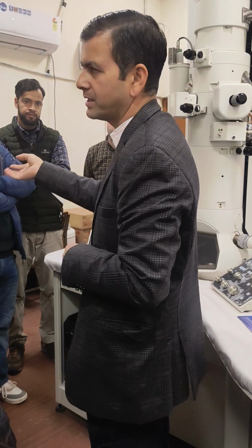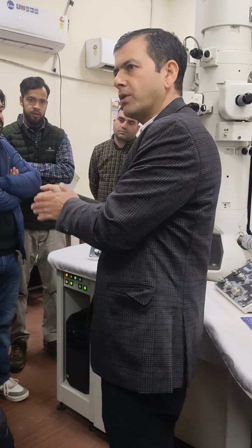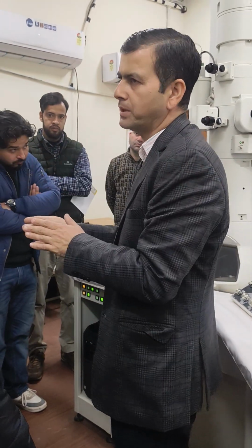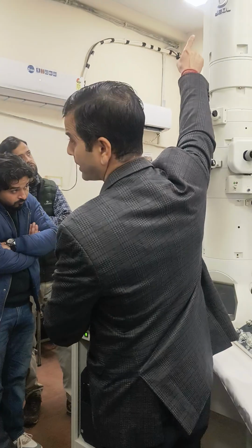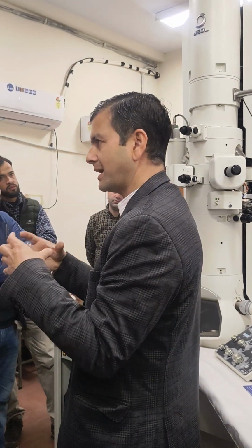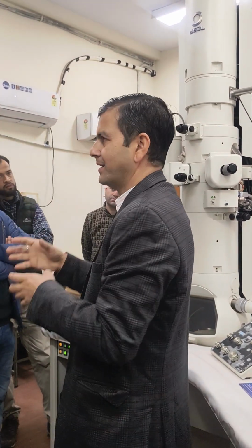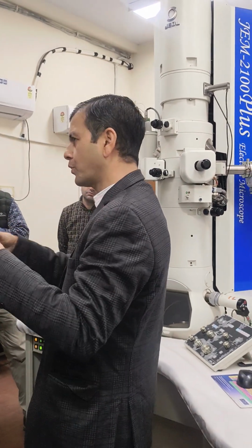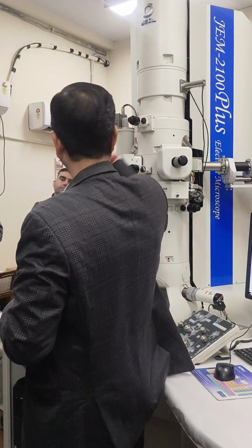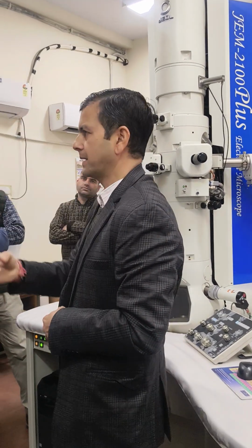Right now we keep on moving. In 2017, the Nobel Prize for protein structure was given for cryo-TEM. Cryo-TEM is one more category, for biological samples under stabilized conditions. That is a separate instrument. So layout wise, the electron gun is there. As we are dealing with electrons, we need condenser lenses. A condenser lens in a light microscope is just to control the light, but here we need to control the electron beam, so we need electromagnetic lenses. There is cooling as well. Inside, it is not big, it is just a column with vacuum in it.